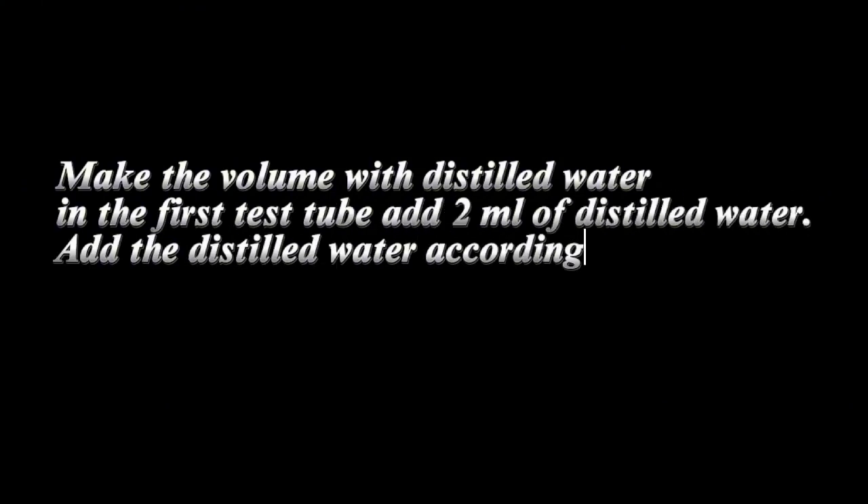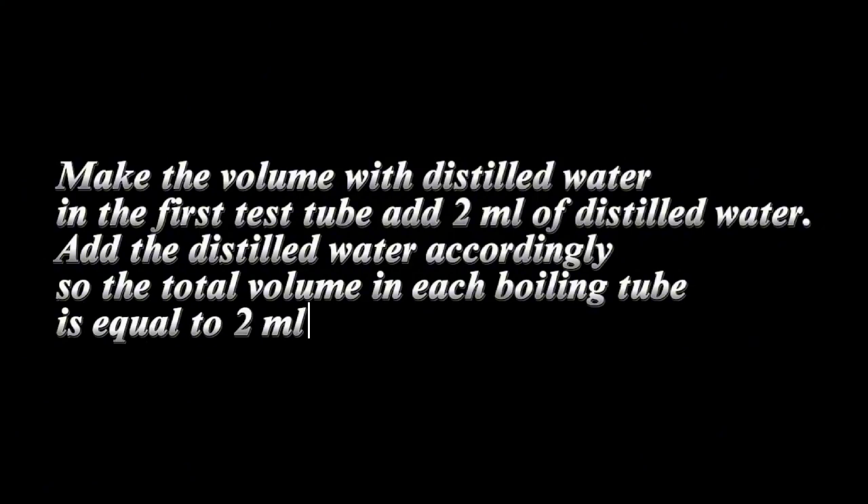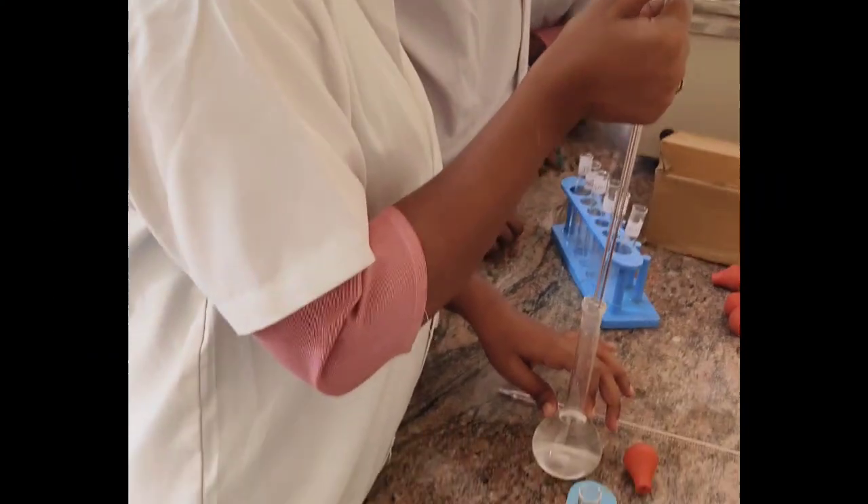Make up the volume with distilled water. In the first test tube, add 2 ml of distilled water, and add distilled water accordingly to each tube so that the total volume in each test tube is equal to 2 ml.